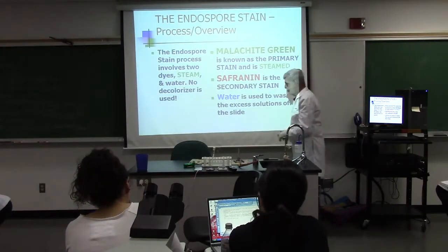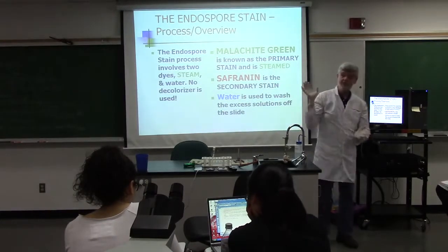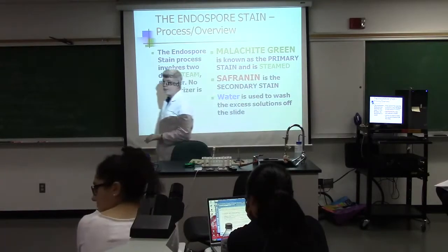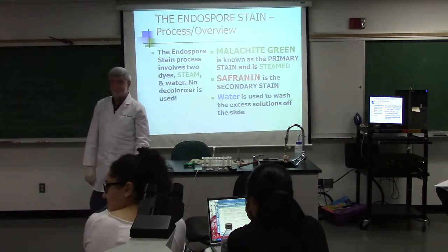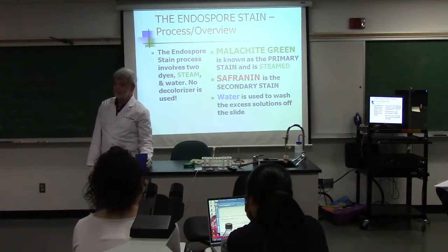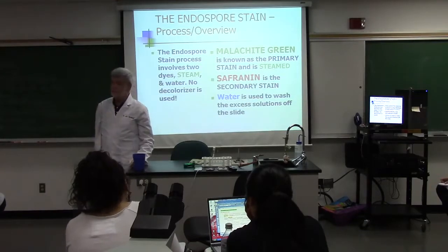So, any questions about process? Because we're going to talk about the problems next, and that's the big one. Yeah? How many times do you have to pass it through the thing? Till it evaporates and pulls back about 10%. Can't do times because where people put it in the flame and how long they put it in there totally varies with the person.